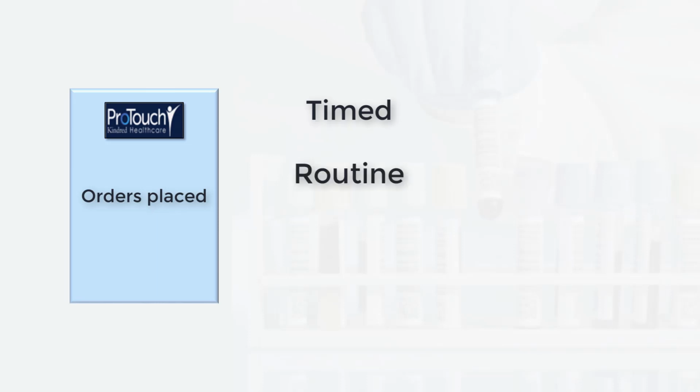Let's take a closer look at the first step that I mentioned, placing orders in ProTouch. Orders should not be timed, unless, of course, it is appropriate to do so, like in the case of a vancomycin trough or other drug level, or maybe for a patient who is on dialysis and the draw should not be done until after 9 a.m. If there is not a specific reason for a time to be designated, then let ProTouch default to the routine time set at your site.